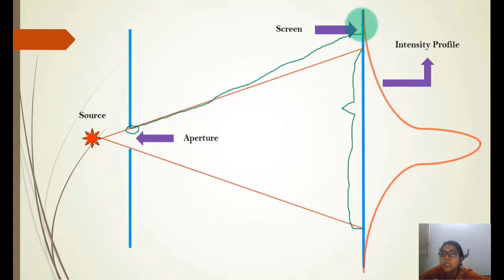So now we will discuss how this diffraction phenomenon occurs. That means what are the conditions. You usually don't see light bending through a corner. But you can observe it when you have light across a room and you open the door and keep it half open. Then the light should reach only through the path provided by the open door, but when you see, there must be some light outside that region also. This phenomenon is known as diffraction.